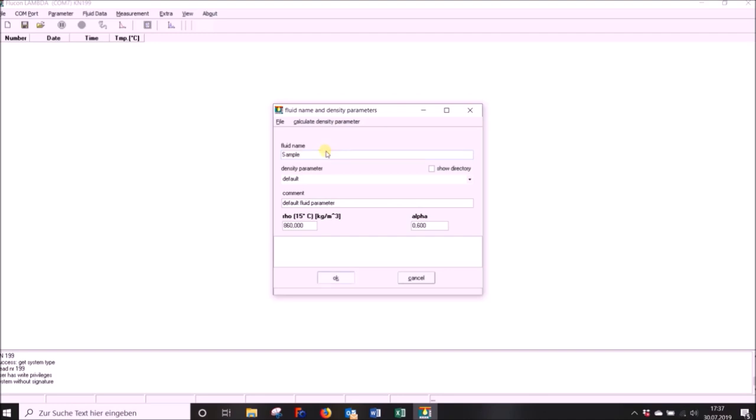If you want to conduct heat capacity in addition to thermal conductivity measurement, please fill in the density parameters of your specific fluid. You may also use the calculator function if you have certain nominal densities available, for example from the data sheet of your substance.